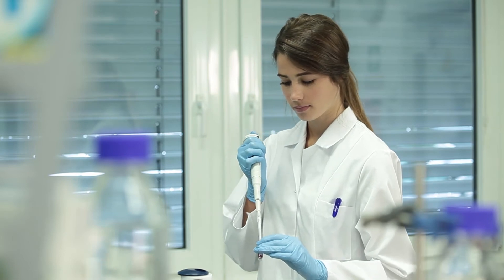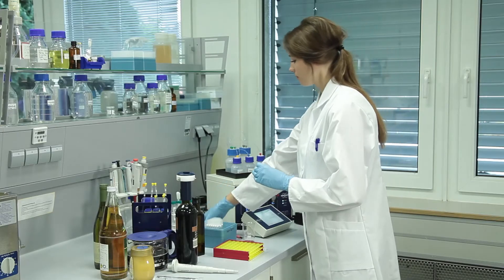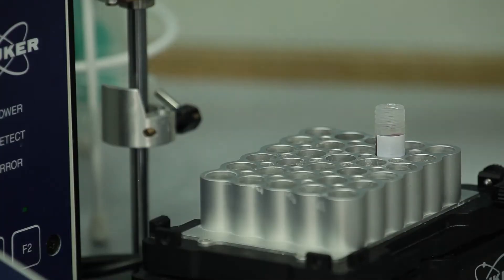After filling a tube with a sample, a precise pH adjustment is part of the procedure for wine and honey preparation.